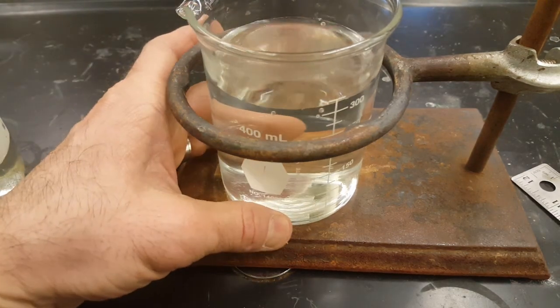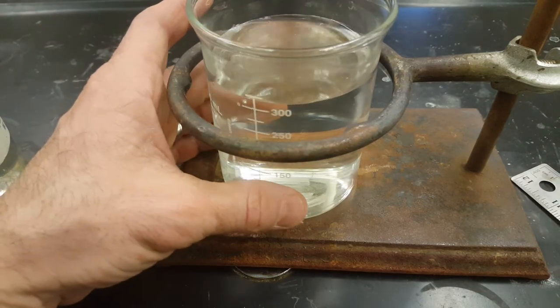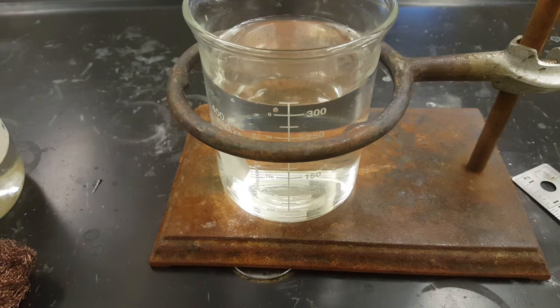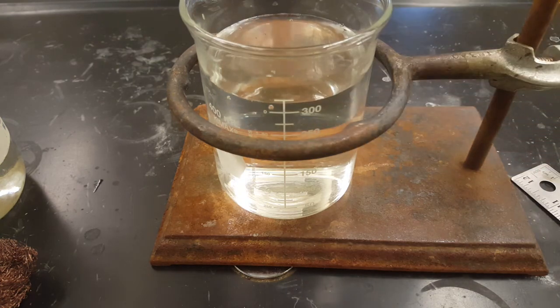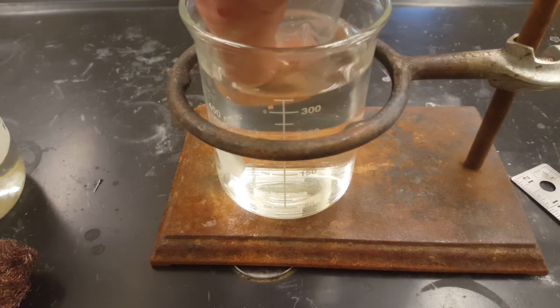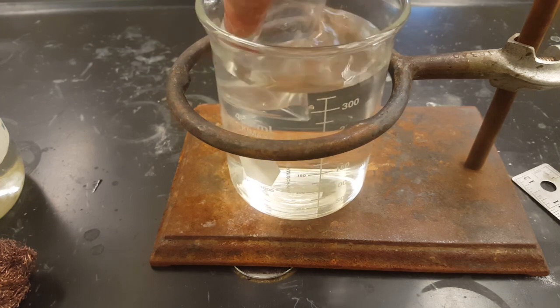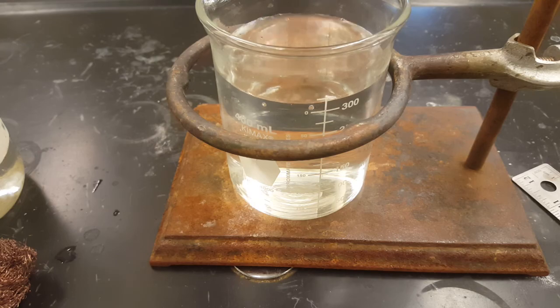Take your 400 milliliter beaker and fill it about 80% to the top. That's going to vary for a lot of you, but if you want to know exactly how much, you want to be able to take your graduated cylinder with your finger over the top of it and be able to fit your finger and the top of your graduated cylinder into the top and reach the top of the water and remove your finger. Do that test first to make sure you have enough water in your beaker.